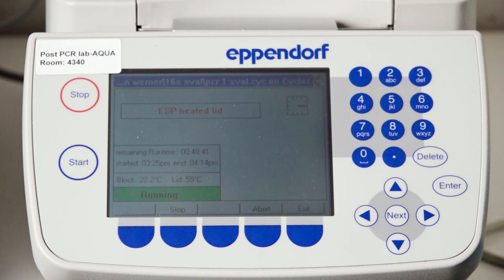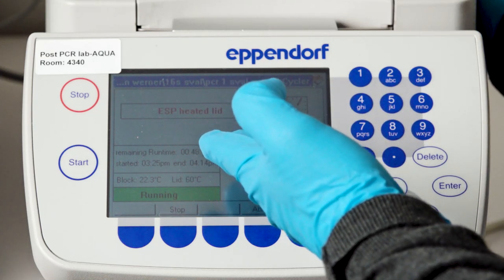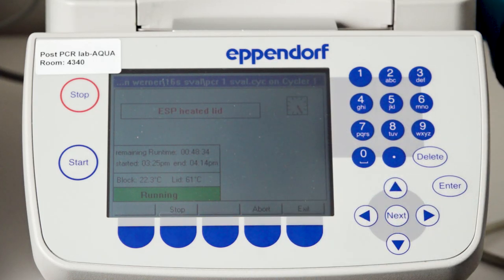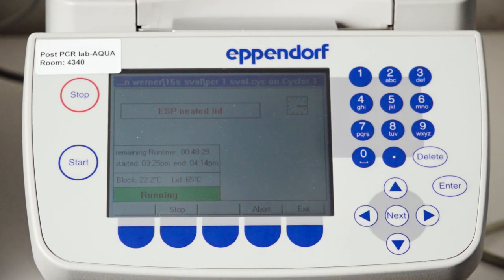Now it says that it's heating, the approximate amount of time that is left. So this is around 50 minutes. It also says the temperature and says running, and the light here is blinking.